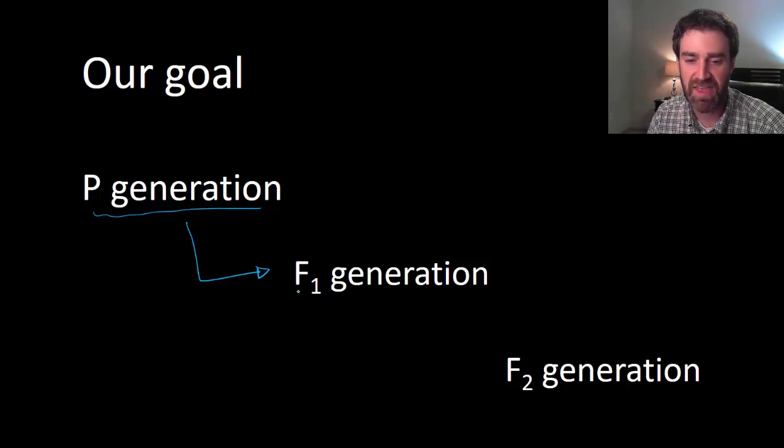Sometimes that's called the F1 generation. F for filium, which is kind of Latin for the sons and daughters. So we're going to look at those flies, and you guys are going to put those flies to sleep so that you can look at their traits and see what they look like. And then you want them to be able to wake up so that some of them can still reproduce amongst themselves and then eventually produce the 3rd generation of flies, or the F2 generation.